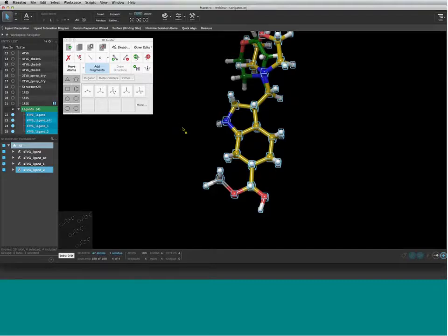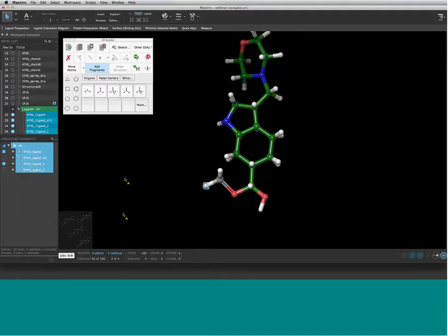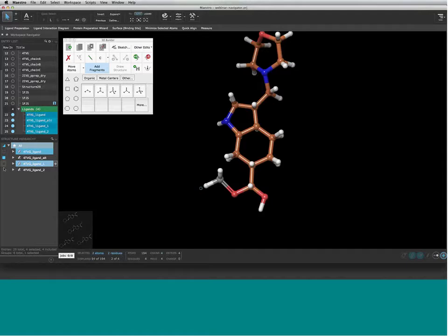And as an aside, because you only operate on the visible, because you can only marquee visible atoms, one trick, if I wanted to add another methyl group but only to 2 of the 4 structures, I can just make 2 of the 4 structures invisible right now. Right now all 4 residues are selected, but if I redo that selection now, I only have 2 residues selected because I made the other 2 invisible before I made the selection. And now if I wanted to add another methyl group, I'm only adding it, as you can see here, to 2 of the residues. And if I want to do something different with these 2, for instance, I could add the methyl here instead.